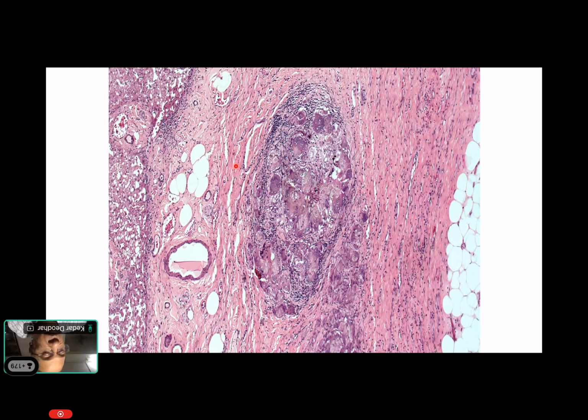We sometimes see residual cancer, which is just invading the liver parenchyma. So it is important to locate that and stage that so that appropriate further therapy can be given. I think for gallbladder cancer, if it's completely resected with negative cystic cut margin, there is definite survival advantage. That's why radical cholecystectomy and assessment of radical cholecystectomy is so important.